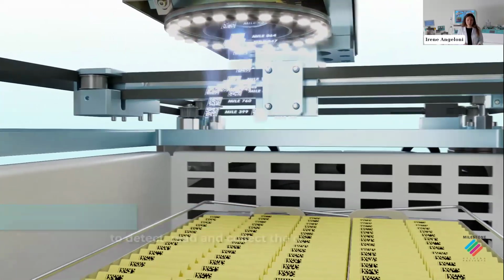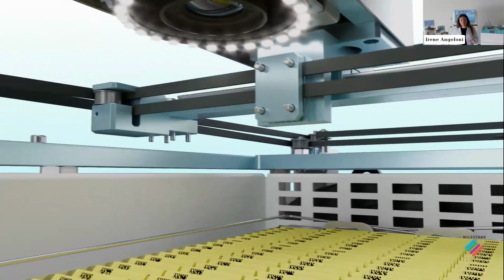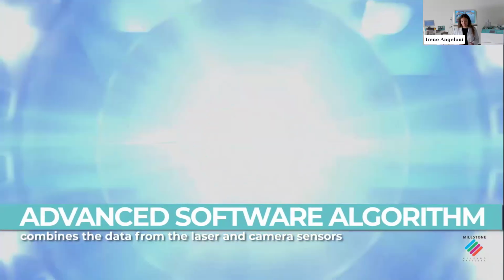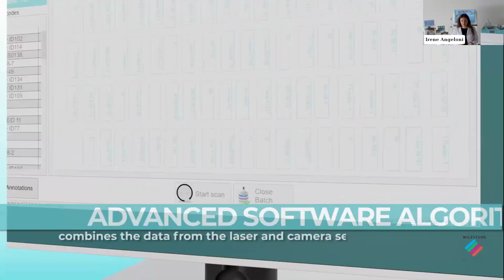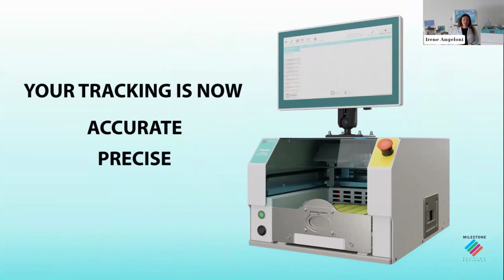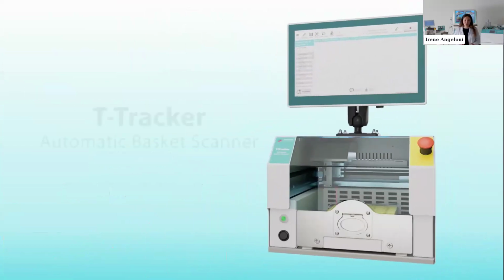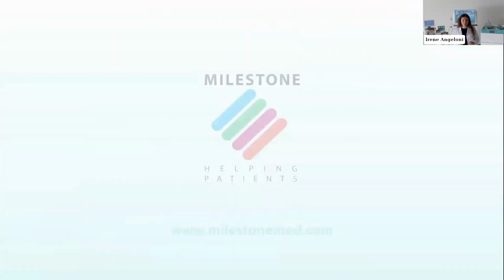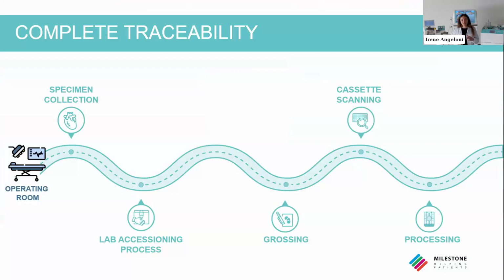Why am I telling you this? Because thanks to this, we are able to detect if errors are present, if we have missing codes. And in this way, we have a reliable scan, we have the documentation, and also regarding, in general, the safety of the sample, we detect if something is wrong.